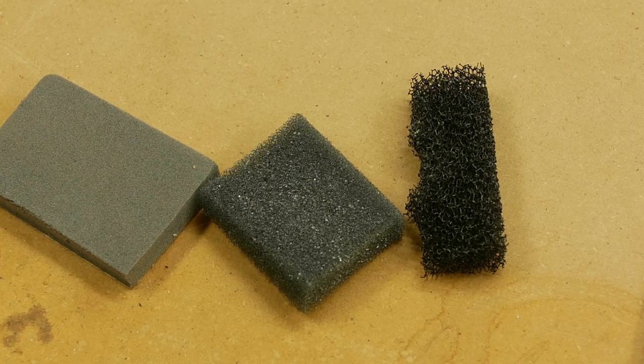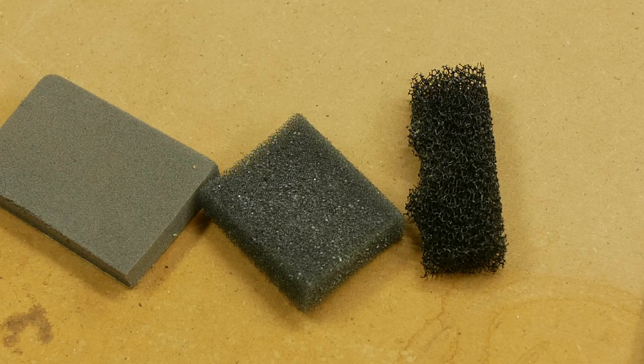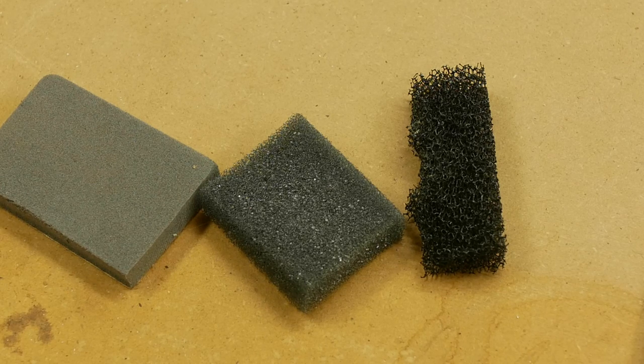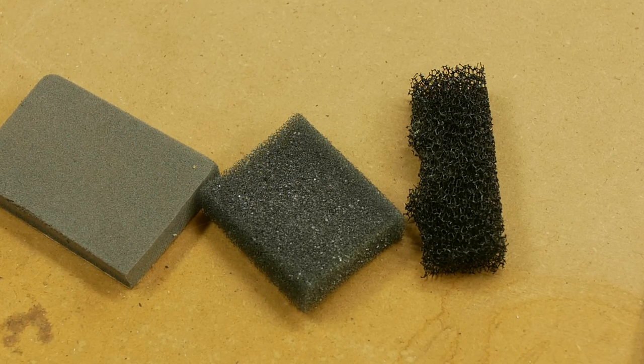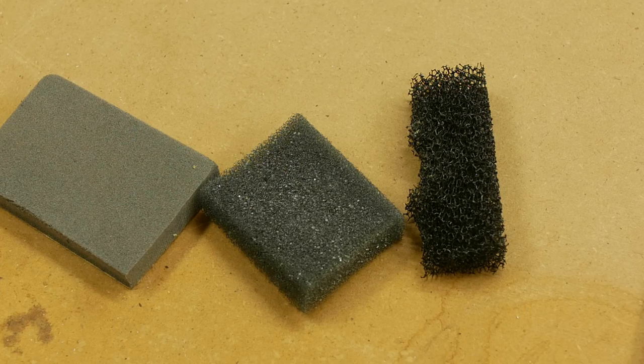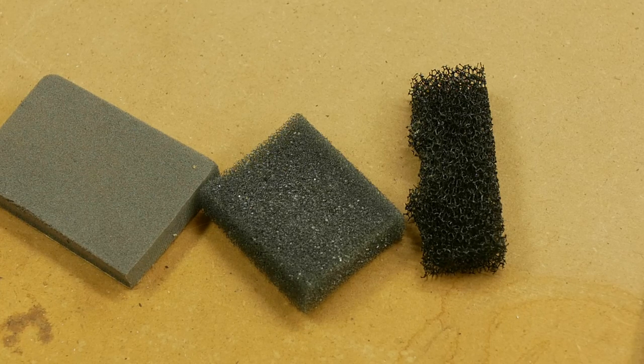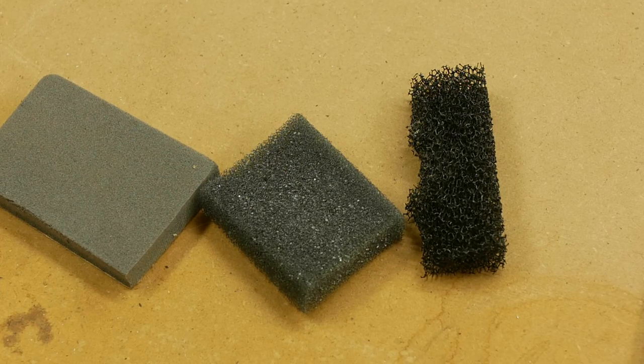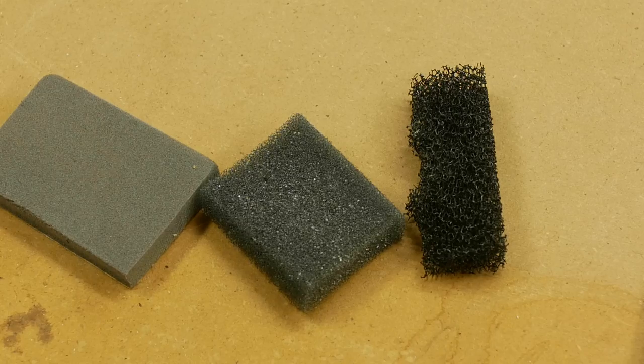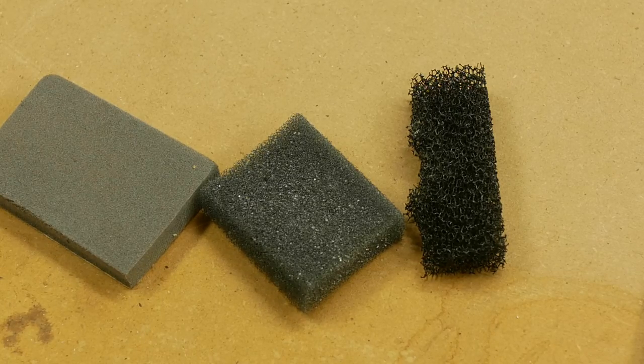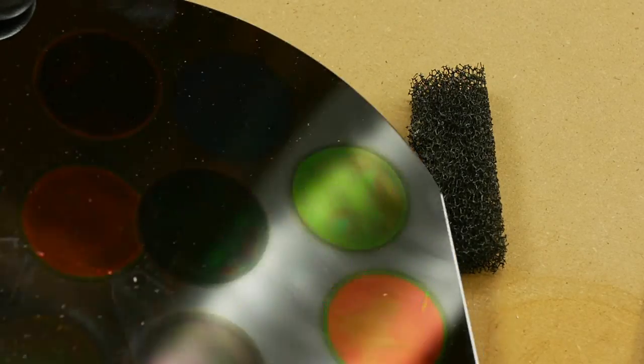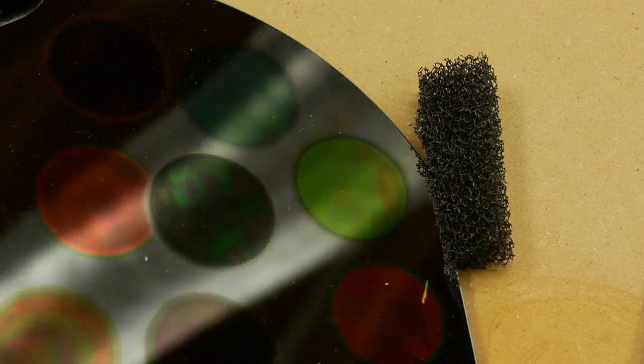Now, there's a couple of things you have to worry about. The etchant itself can dissolve the silicon even without electricity. So if your etching process goes for a long time, yeah, that'll hurt your thing. And there's limits to how high and low the porosity can be. But I think we can change the index all the way from pretty close to 1 all the way up to 2 point something. So we actually have the ability to make really good optical filters because we have so much control over the index.